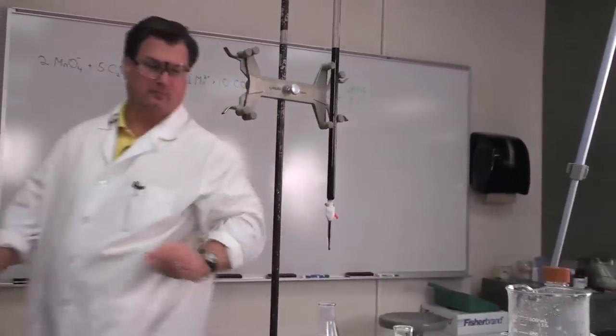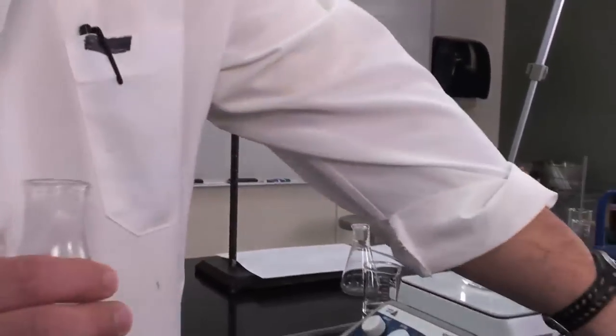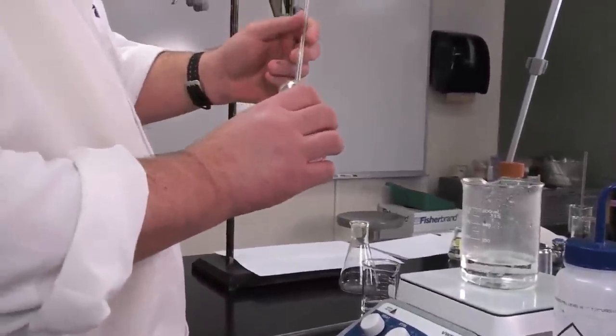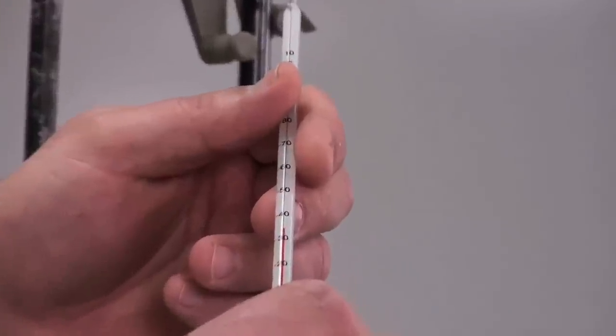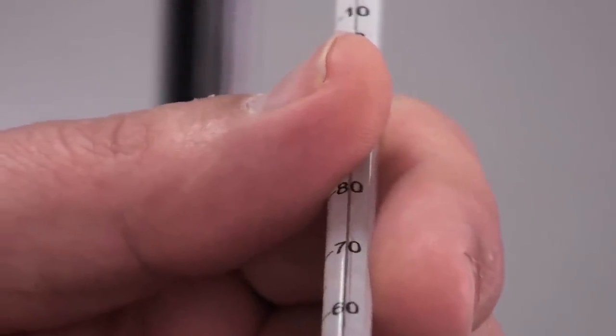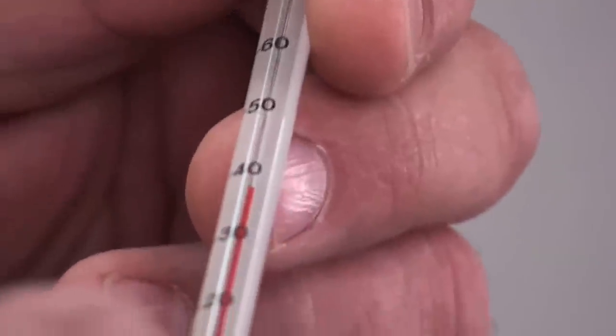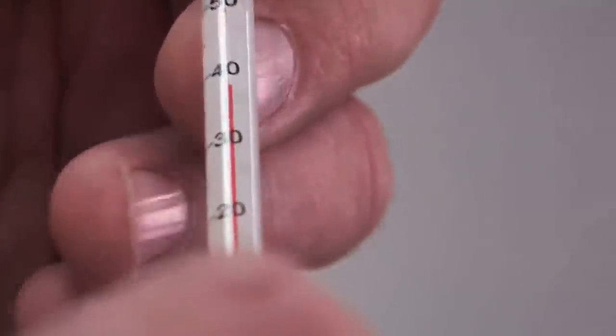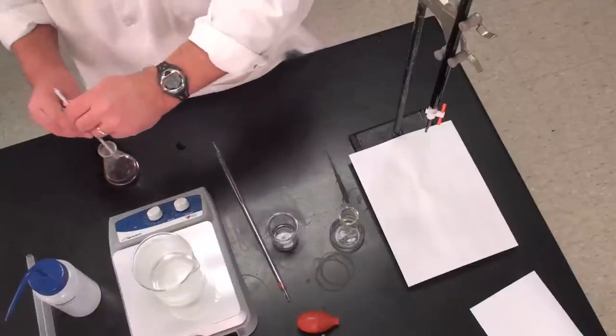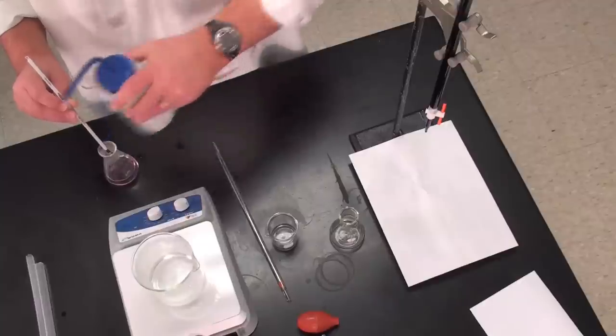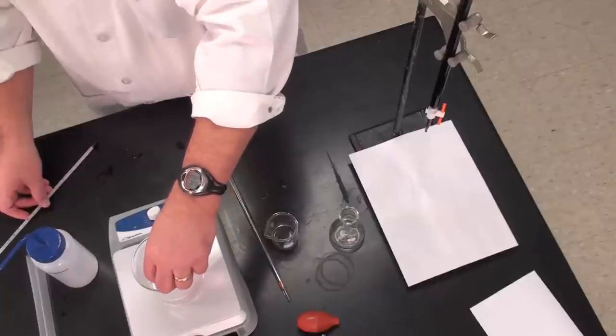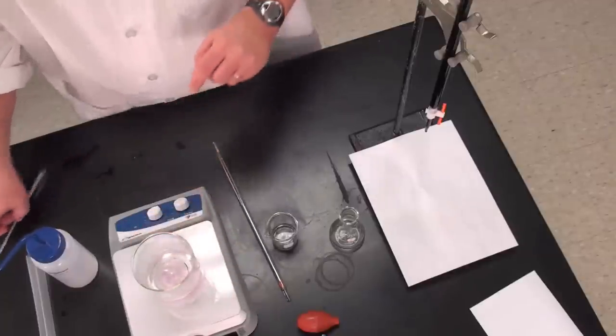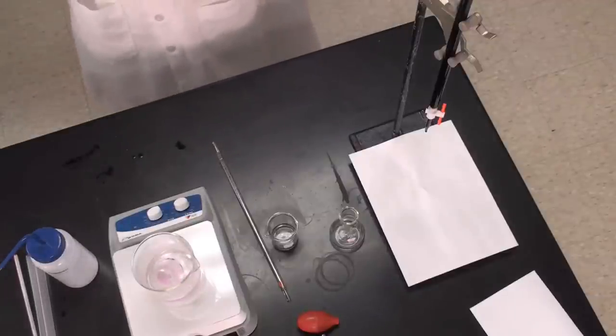I also want to check the temperature of my solution just to make sure it hasn't gotten too cool. So I'm going to verify that my temperature is still reasonably high. Ideally we'd like it to be above 60 degrees still. Looks like we're at about 40. So what I'm going to do is warm it back up a little bit and see if that color disappears, because if it does that means we didn't quite hit it because it wasn't warm enough.